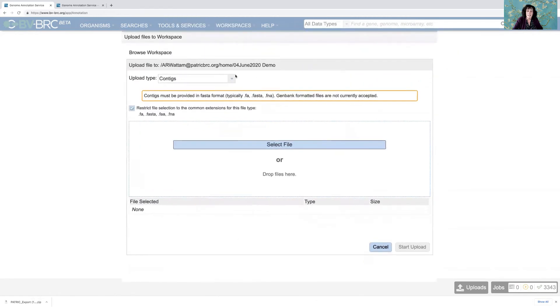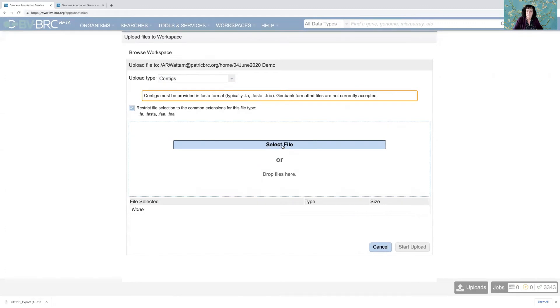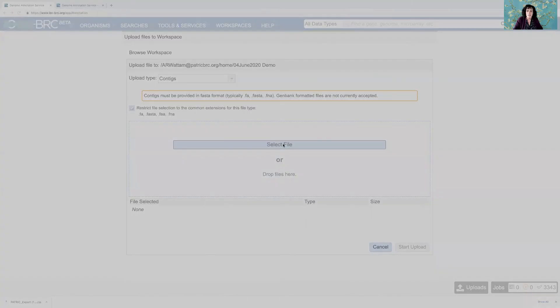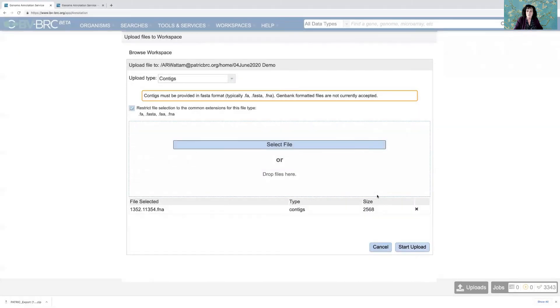And then it says it's going to be looking for contig files that end in .fa, .fasta, or .fna. So when I click on this, it's going to open a dialog box with my computer where I can navigate to an .fna file that I want to use.